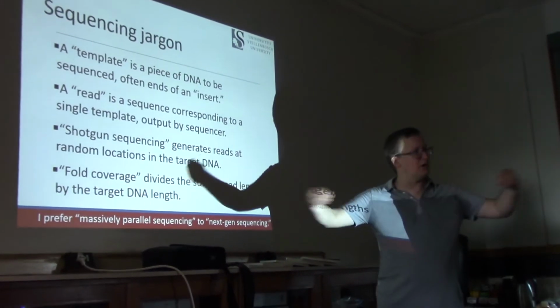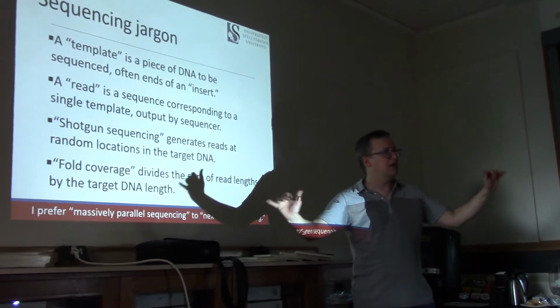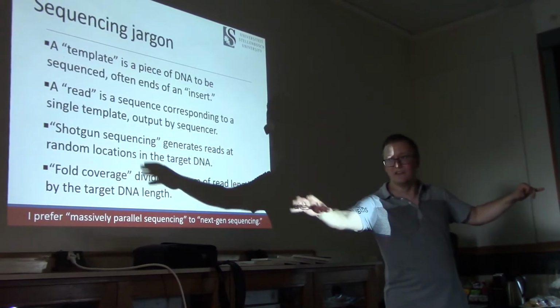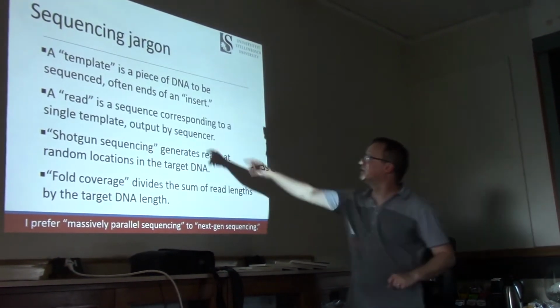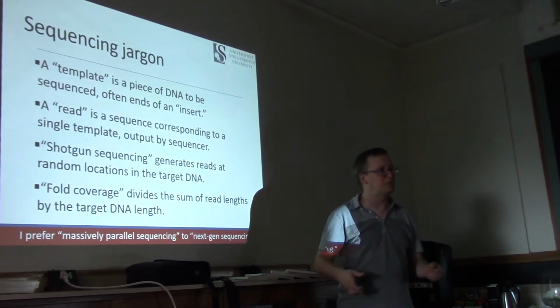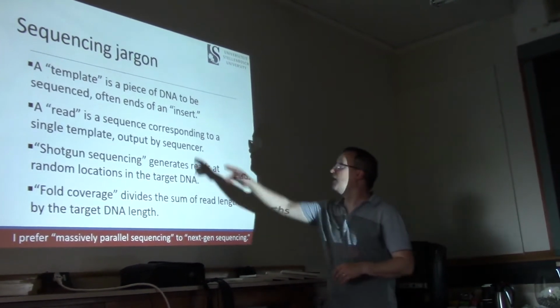This is a case where we have a long piece of DNA, maybe thousands of nucleotides, and we're not going to sequence the whole thing, we're just going to sequence the very ends, like the 5' end and the 3' end. So for that, we have a longer piece of DNA, often called an insert, from the days when people did a lot of bacteriophage libraries and so on.